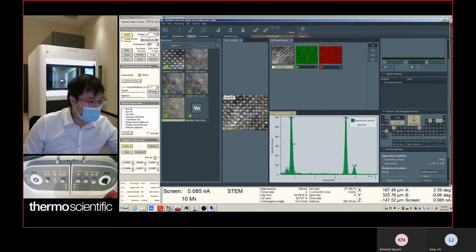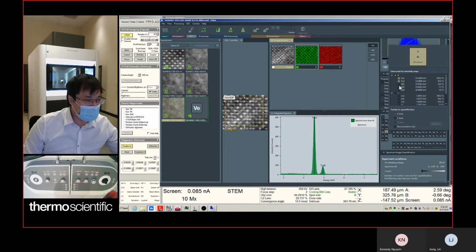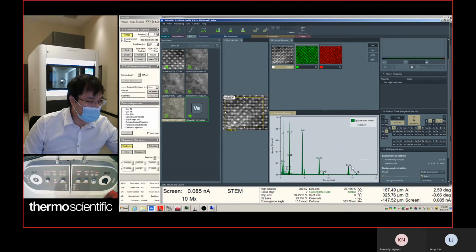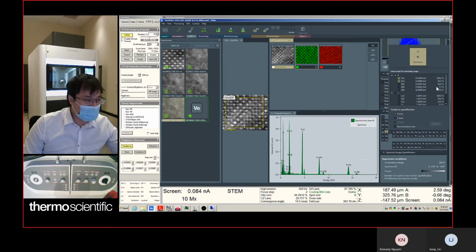Do we have a K peak for the strontium? We can check that. We don't have a strontium K peak. Oh, we have a K peak here, so we can use that. Definitely, we can include the L peak, L alpha, beta, lambda for the quantification.